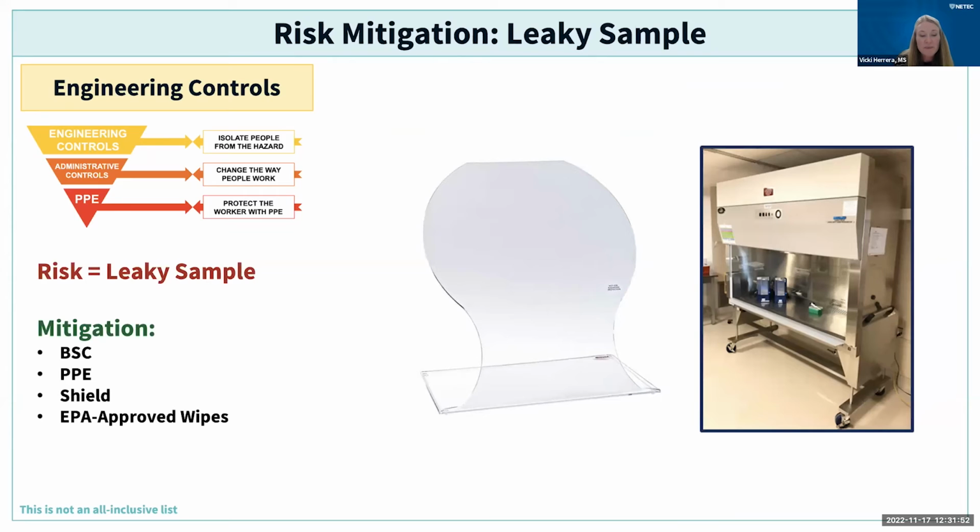How about a leaky sample? Oh, that's always the favorite in the lab. This is one of the items that the laboratory just loves to see. So what can you do in this situation? Could you ask them to redraw the specimen? There's a lot of things that you have to think about if a redraw is necessary. That's also providing another needle stick for a patient. You have laboratory staff or you have nursing staff going back into the room with the patient. So really consider if that's an option.